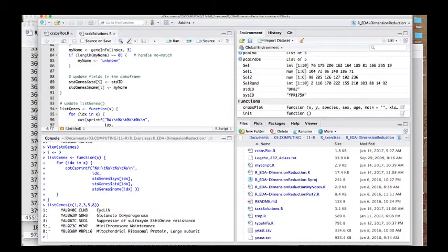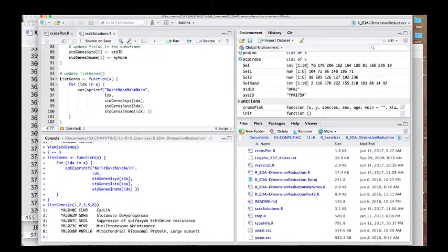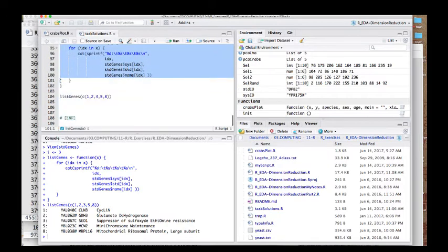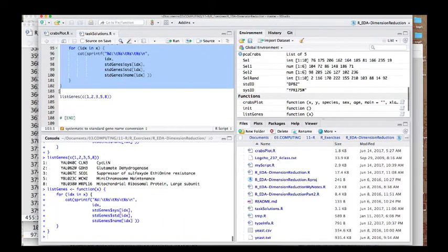So now it looks like this: we have the row number, the systematic ID, the standard symbol, and the gene name. If we find some interesting gene sets, there might be clues about what these genes are in that information. To make this list_genes function work, you'll simply have to select and define it.